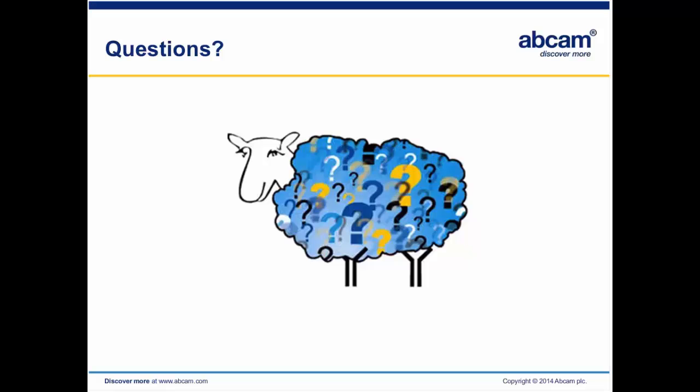And the second question is: is input or IgG a better control? Actually, they are both okay for ChIP-seq experiments as controls. Different people use different controls. For us, we prefer the input as a control because it provides much more complex libraries.